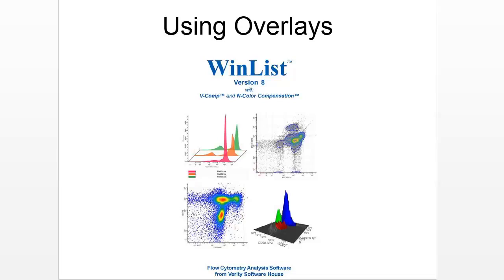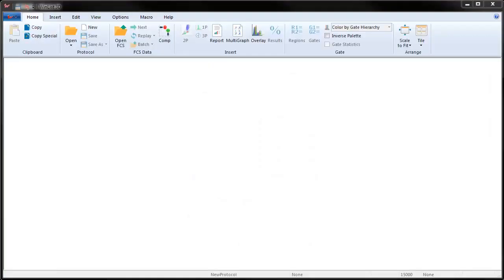Overlays offer a convenient means for graphically comparing a set of one-parameter or two-parameter plots. WinList Overlay offers a number of different views and a variety of graphics options. This tutorial explores how to create them and some of the properties you may find useful. Let's get started.